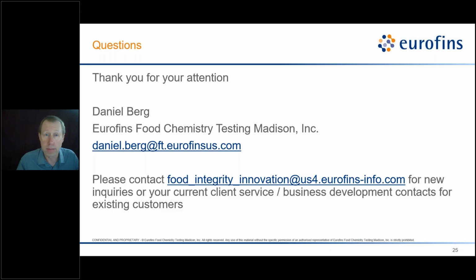Is there other sources of nitrogen? Are there non-protein nitrogens in your product? Are you interested in a very specific protein? Those are kind of the foundational questions that will help guide, do I just need a crude protein analysis?